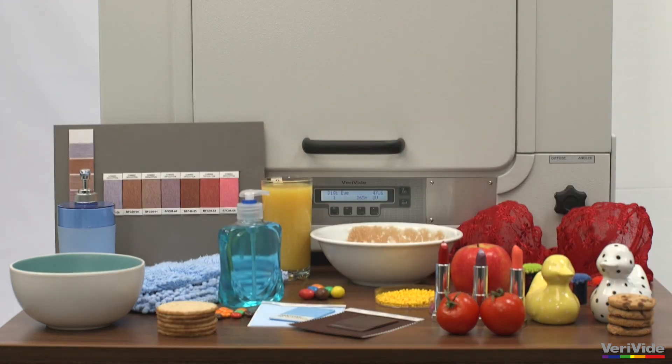DigiEye is capable of imaging and measuring almost anything because it sees colour in the same way as the human eye. DigiEye allows for accurate colour visualisation as opposed to scientific colour data that estimates how a product will look.